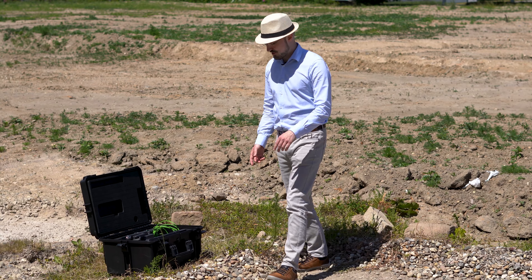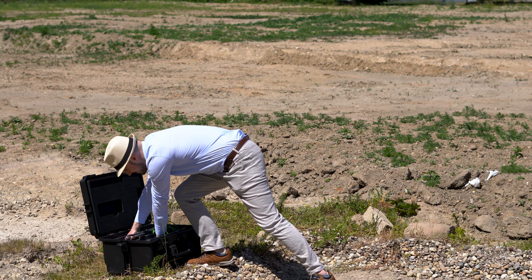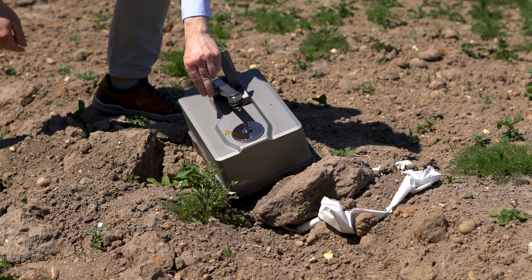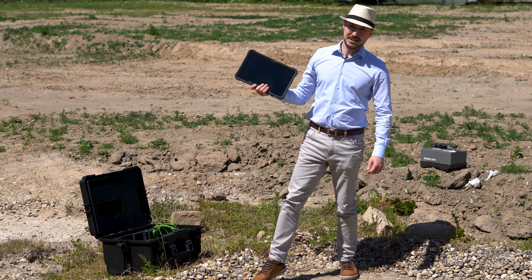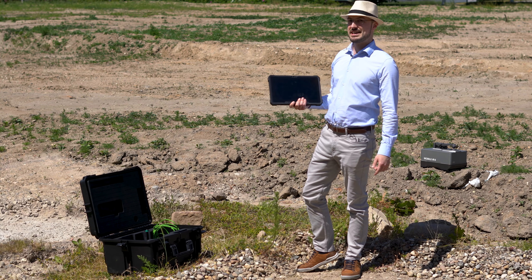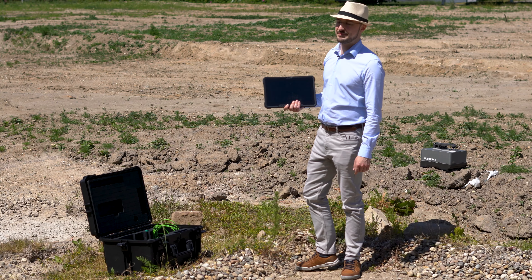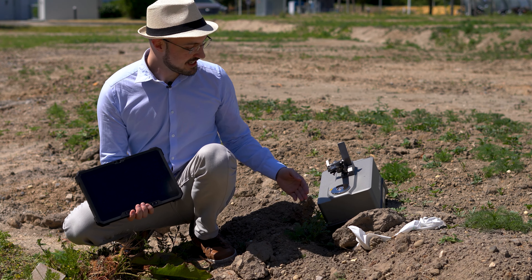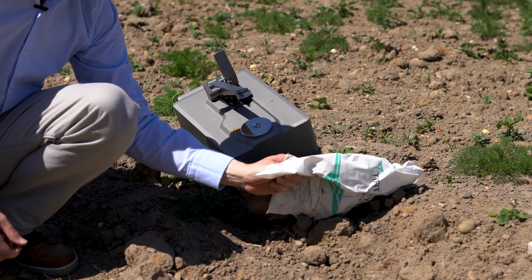To use the Mobile IR 2, you simply take it out of the trolley and put it right into the dirt. Don't forget to grab the tablet. By the way, both are IP65 protected. And the setup is not the only thing that's easy — the tablet and Opus Touch connect automatically and wirelessly with the instrument. Now we are ready to go.